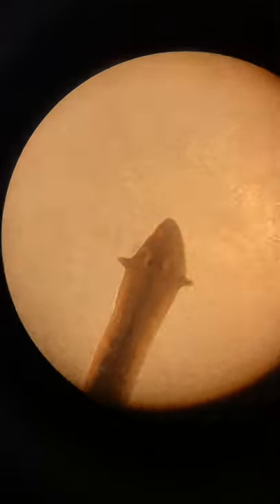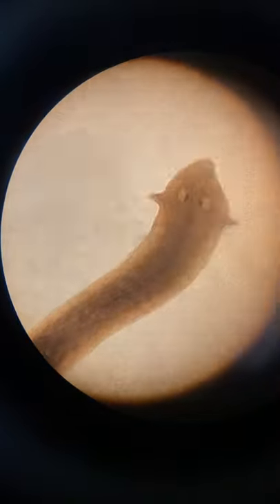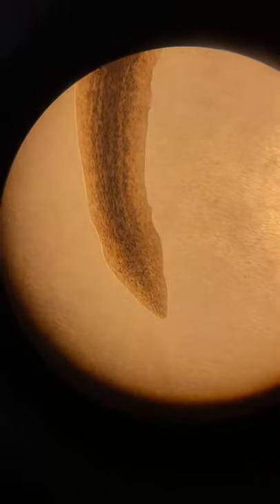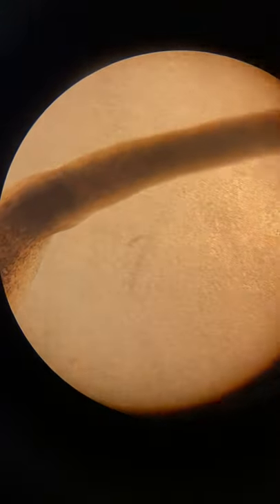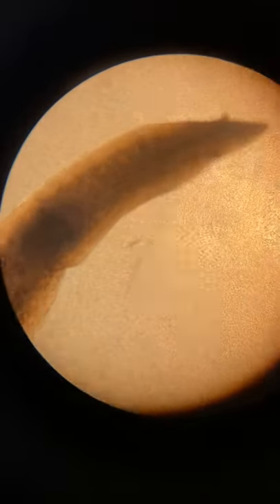Down here towards the head is the anterior side; the tail end is the posterior side. His back side is dorsal, so his underside is ventral. You can kind of see him twist.